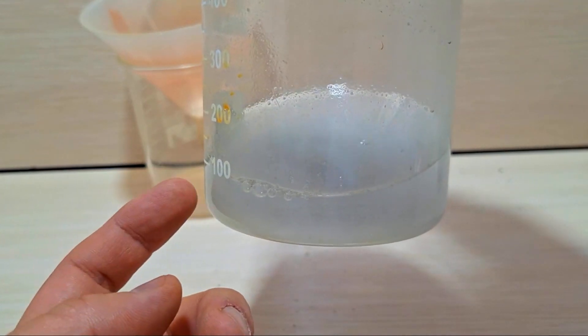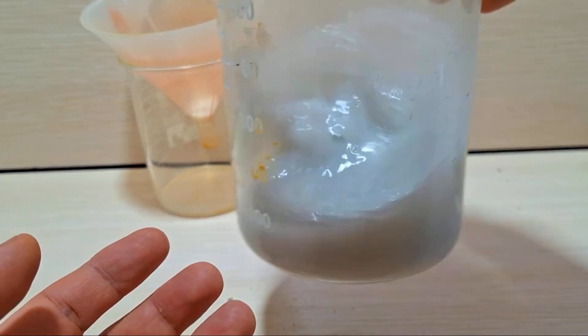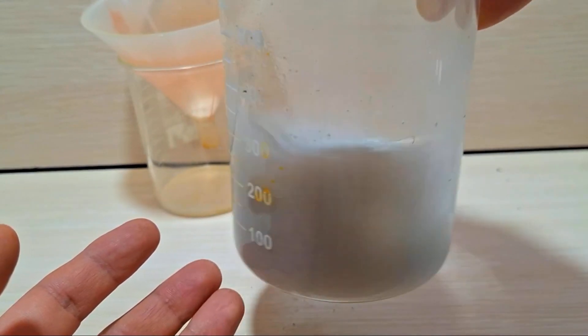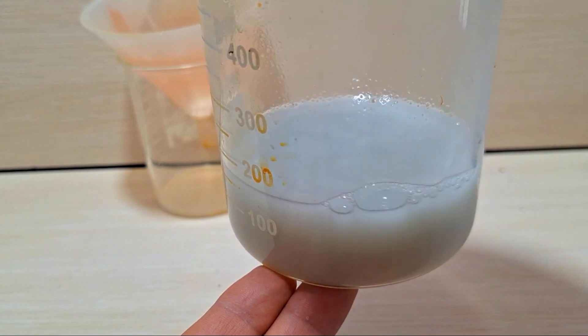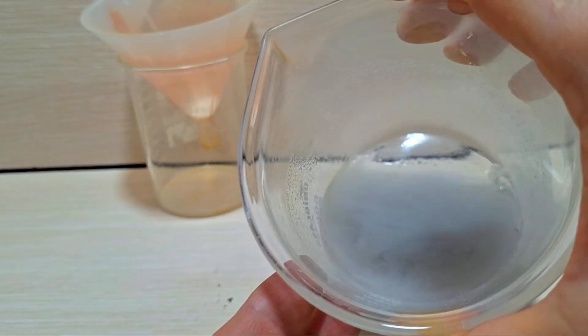Lithium is transformed into its metallic form, although it's not very easy since storing metallic lithium is challenging — it needs to be kept under oil. If you look closely at the solution, you'll see the iron has darkened. It takes several hours for lithium salts to fully dissolve in the sodium hydroxide solution, so I'll set it aside for now.